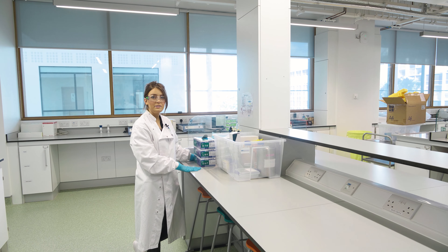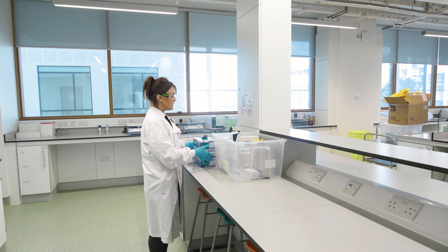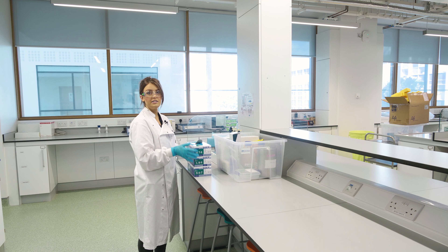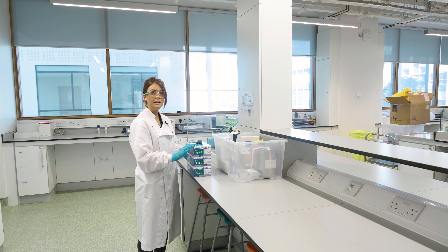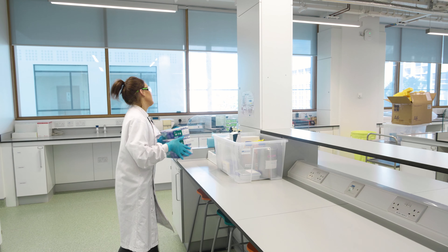Hi, I'm Anne-Marie from the Amgen Biotech Experience and I'm going to show you how to unbox Lab 3. The first thing you'll notice is there are three sizes of gloves in your kit: small, medium, and large. To make it easier for everyone in the class, you should leave these at your bench.